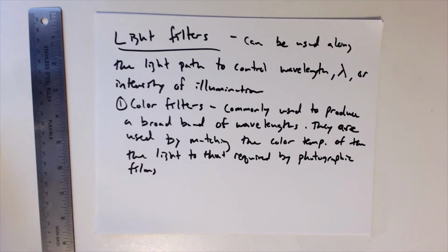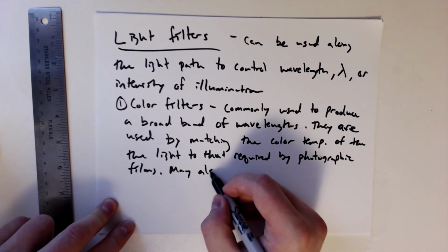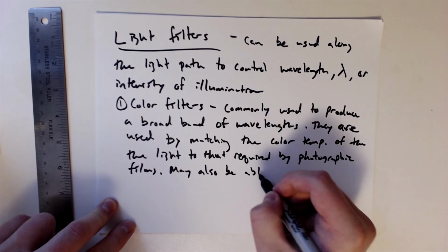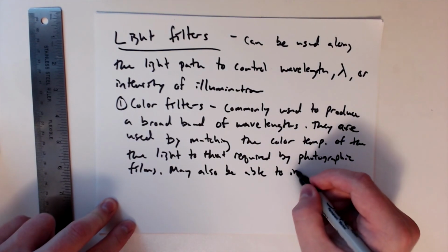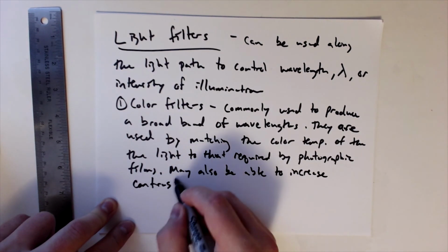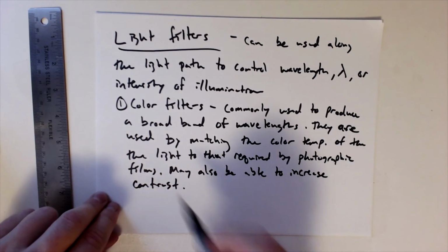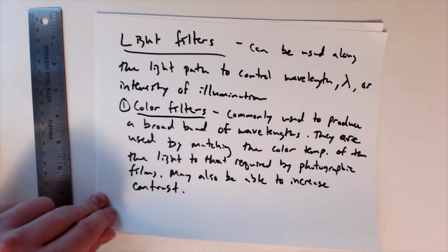So if the photographic films need a particular color temperature, then this can be used. Also, they can be used to increase contrast. So a couple functions there. So that's color filters. All right.